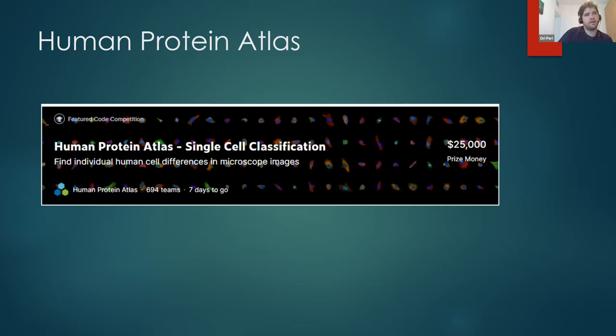One more thing, probably interesting, is the fact that although it was in 1997, the mission of classifying single cells is still interesting to this day. Actually, there are a lot of competitions on Kaggle. This one is what we saw today, and it's actually still open. Most of them are part of the Human Protein Atlas, and the fact that it is still an open mission, or an open competition, and there are a lot of people trying to get better and better results in this world of single cell classification.